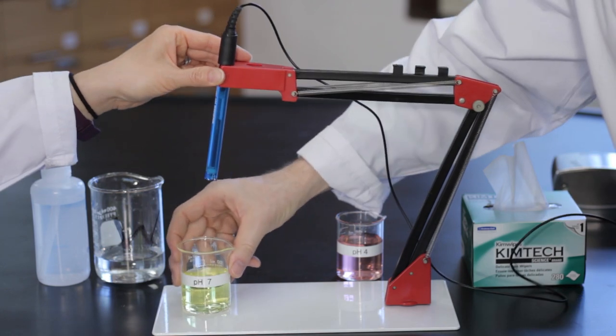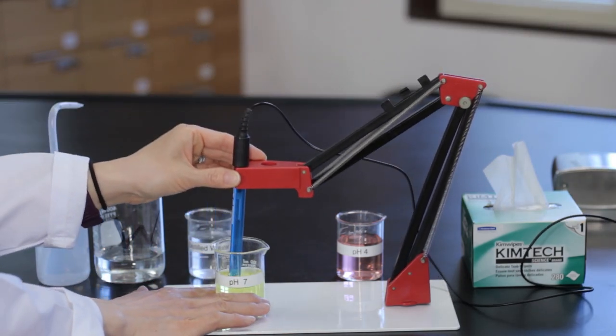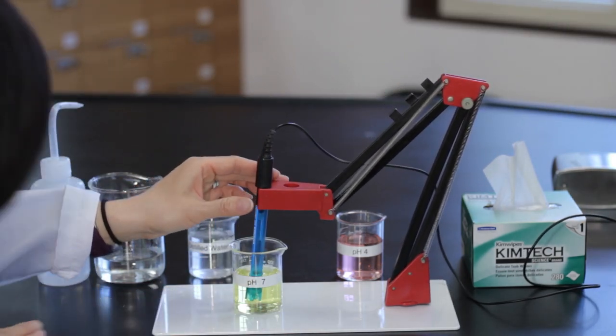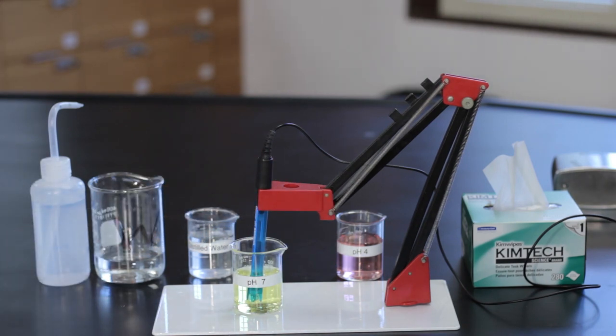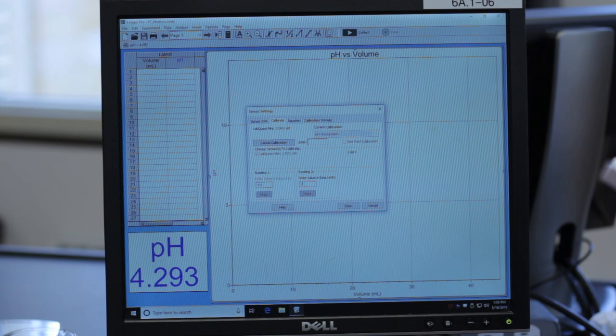Carefully insert the pH sensor into the pH 7 buffer solution. Set reading 2 to 7.0, click on keep, then click on done.